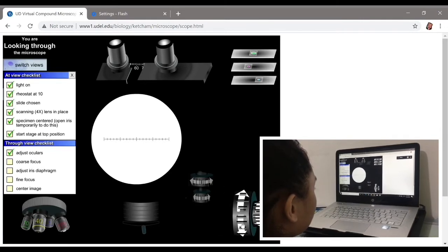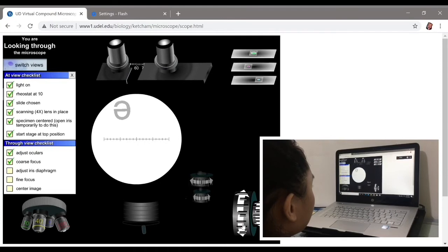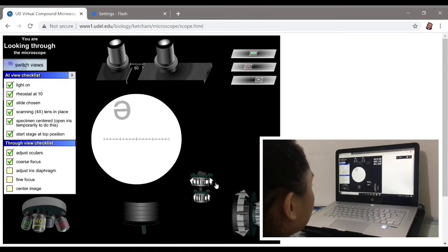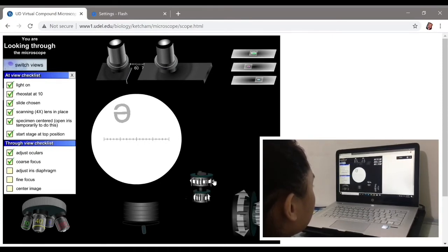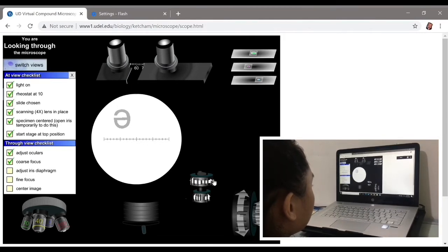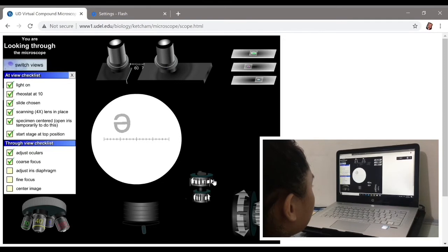Next, I clicked the coarse focus downwards until the image appeared. After that, I readjusted the X and Y knobs, found focus, and adjusted the iris diaphragm for a much clearer and brighter image.